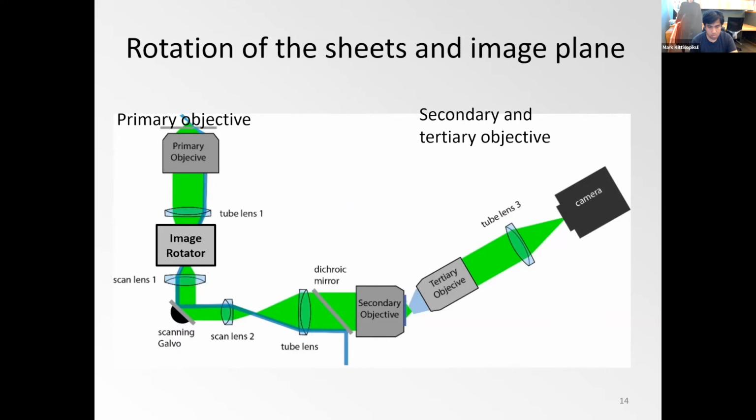So in an abstract way, you could think of scanning and descanning with the galvo, and rotating and derotating with the image rotator. And both of these methods allow you to keep everything else down here steady, because the path doesn't change up to here, and only then it gets rotated, and on the way back, it is undone. I have to think of a way of animating this. Maybe it will make things clearer. Let's just assume this works.